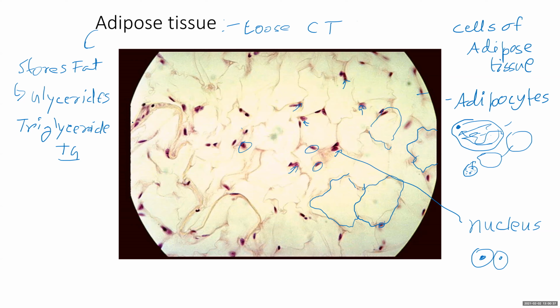And it's vascular. You can see blood vessel. So basically what you are looking at here is a blood vessel. So vascular, filled with adipose fat, triglyceride. Adipocytes, this is a loose connective tissue. Does it have interstitial fibers? Yeah, it does. We just don't see it because the ballooning cells have covered everything else. It's kind of a little special looking connective tissue. So areolar and adipose.